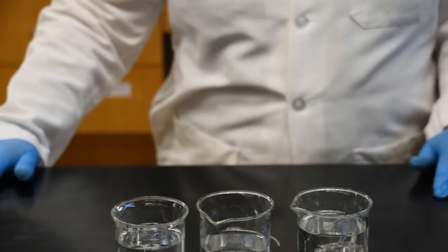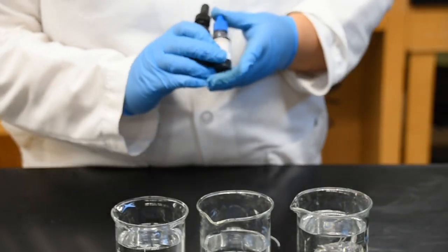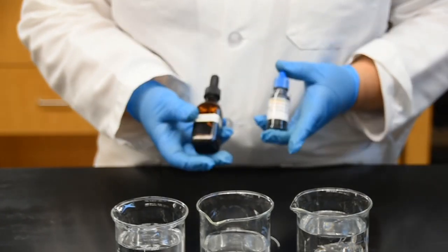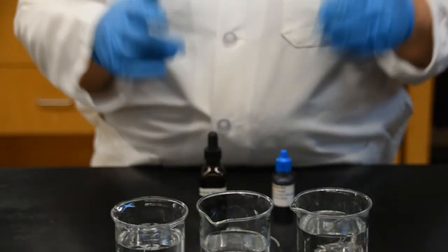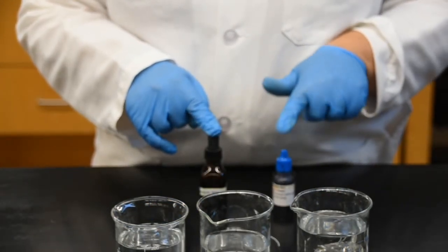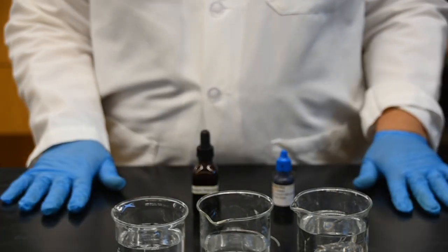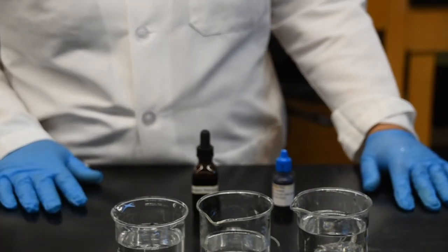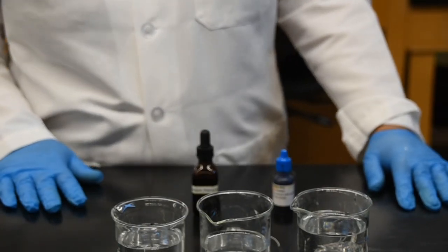So to test this, we're going to be using two dyes. One is our methylene blue, and the other one is potassium permanganate. So what you would do, first of all, you will go ahead and search these two dyes, again methylene blue and potassium permanganate, and look for their molecular weight. So when you find that information, you guys are going to enter it on the chart in your lab, where it asks you for the molecular weight of these two samples.